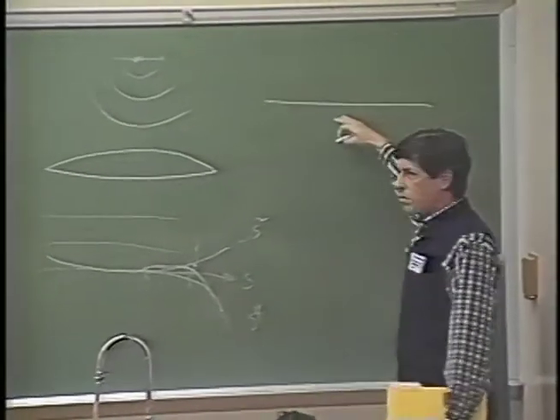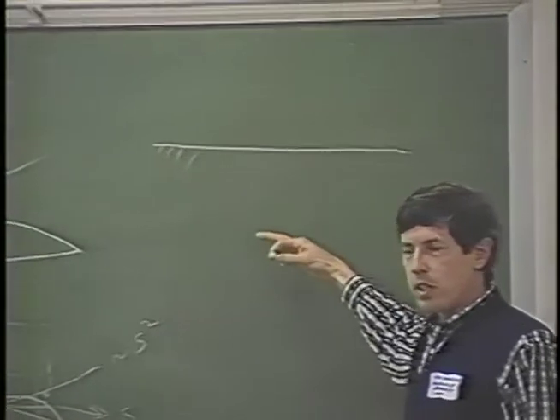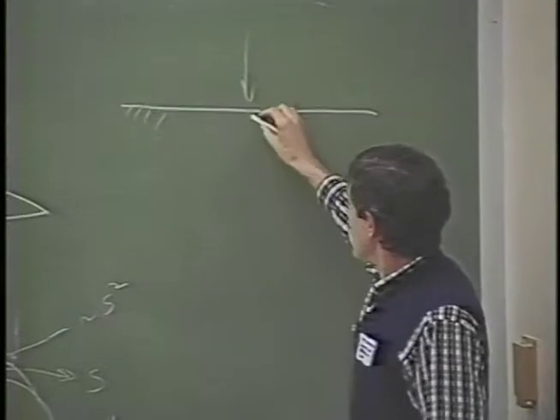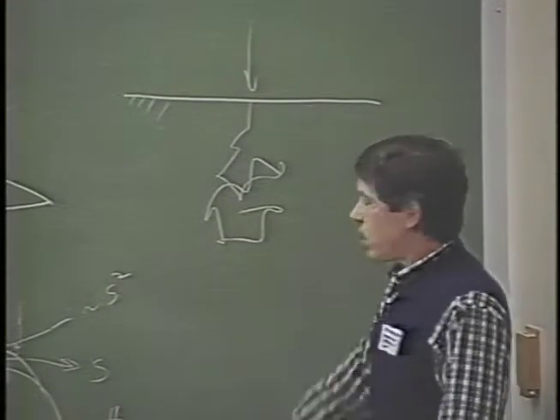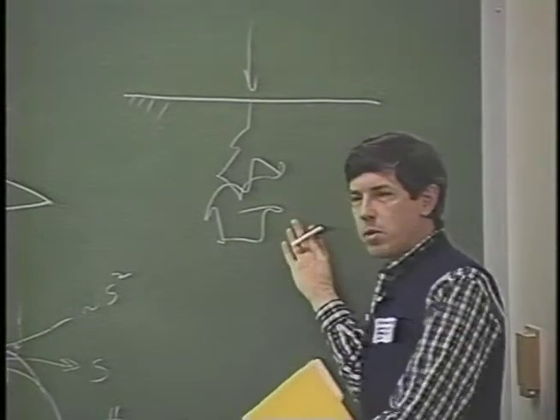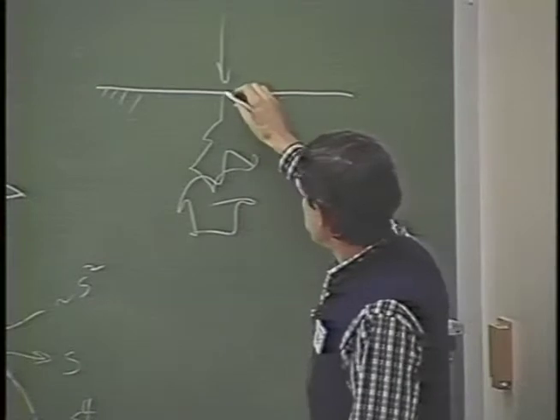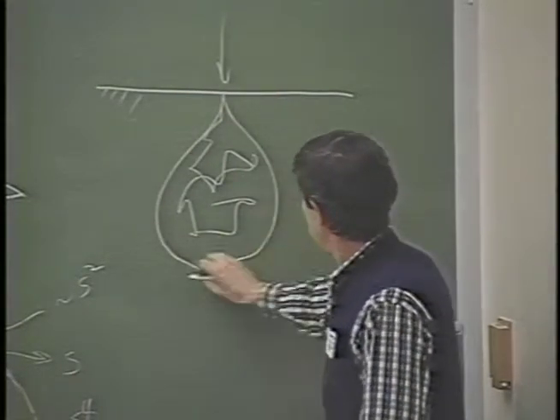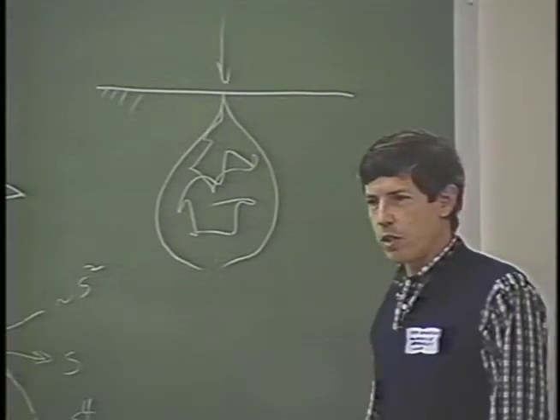If this is the surface of the photographic emulsion, so that down below here is the film itself, an electron coming in here will come in and start scattering around, and either the electron itself or secondary electrons or X-rays generated in the process will cause a region that's sort of a teardrop shape to be exposed and to develop for each primary electron.